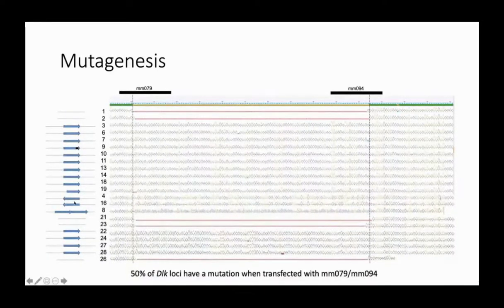If we looked at the mutagenesis that we created, we saw that when we put in 2 gRNAs, we would often see inversions of the intervening sequence or deletions of the intervening sequence. But only occasionally would we see individual mutations where only one site but not the other is being mutagenized, as shown in construct 9.